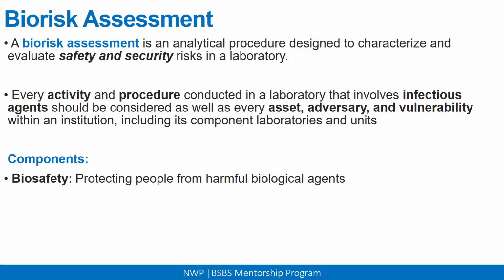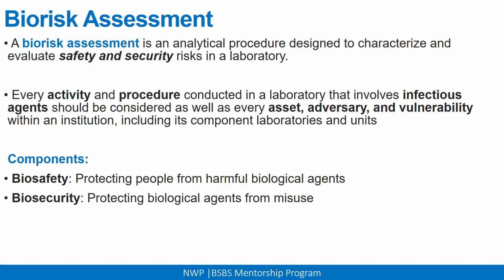So, of course, there are two components of the biorisk assessment. One is called the biosafety risk assessment, where you are simply protecting people from harmful biological agents. If you conduct a comprehensive biosafety risk assessment, it means that you would have at least protected people from the harmful biological agents that they are handling in the various institutions or laboratories.